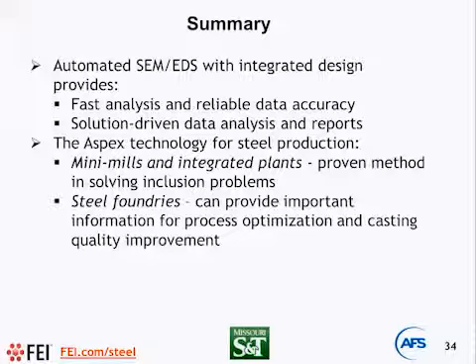There has not been a way to eliminate that effect. But we also apply so-called zero-element rules. When we have a spectrum, and the spectrum has a matrix, we apply rules which remove the matrix. Let's say that if iron is more than 10%, we assume that iron equals 0, and all other elements equal 100%. This allows us to evaluate inclusion versus oxidation area or versus porosity.